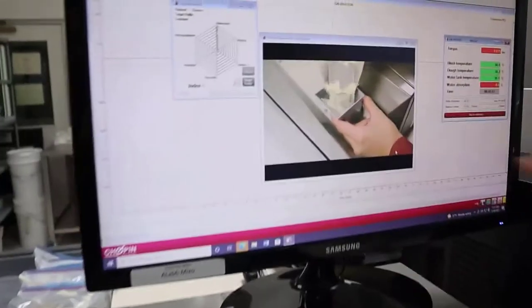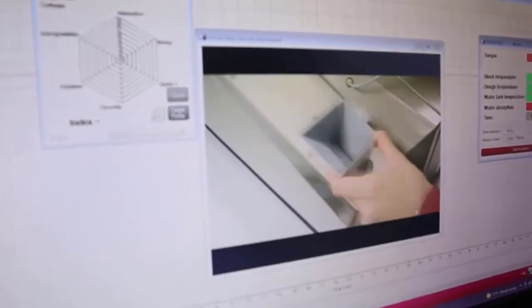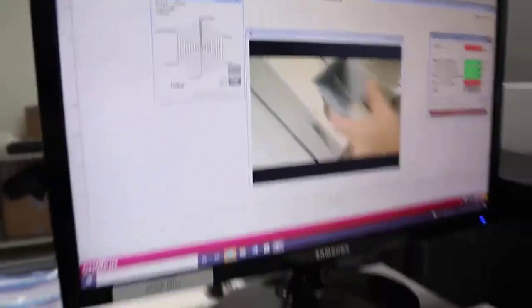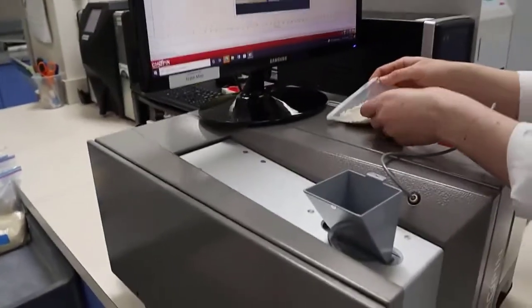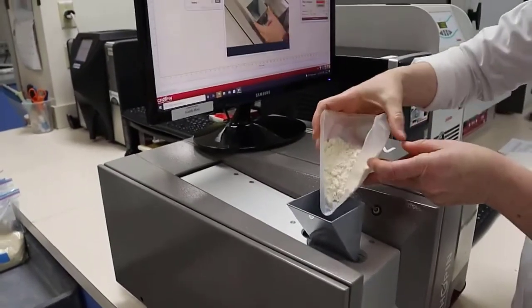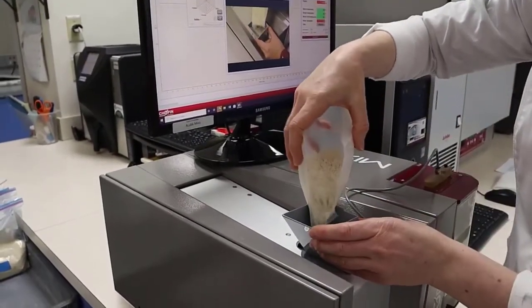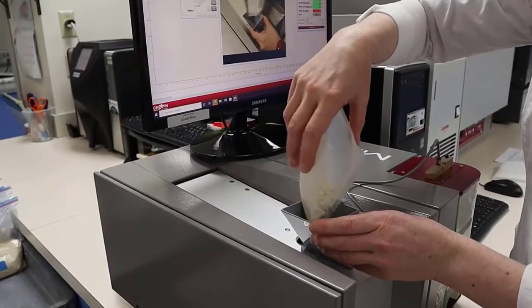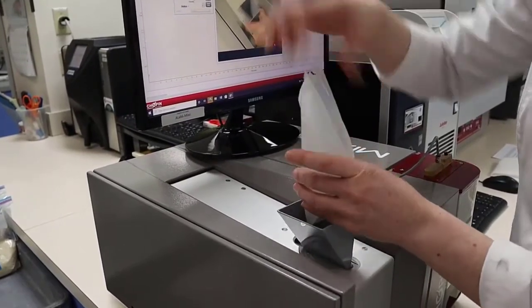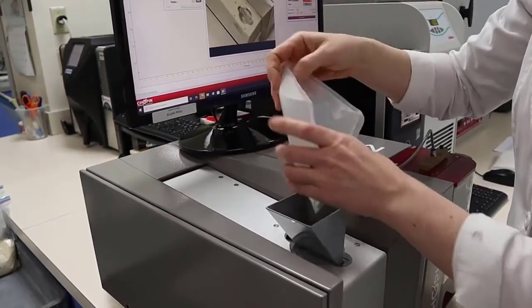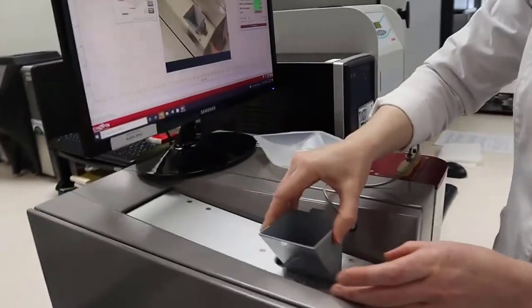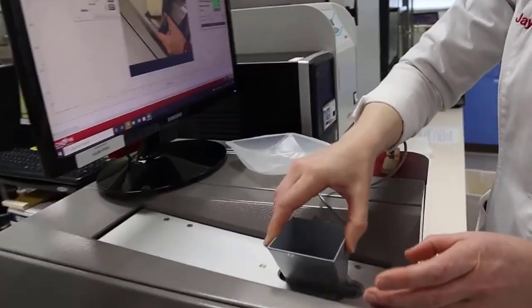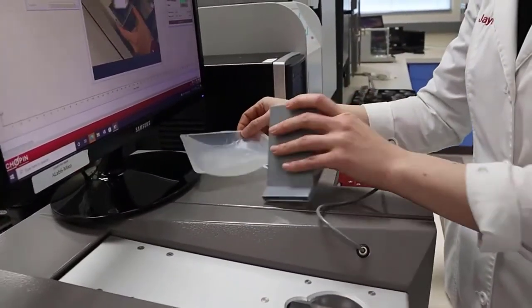So the software automatically pulls up videos showing what you need to be doing at any particular point in the test. So at this point I need to be adding the flour. So using the funnel that comes with the instrument, make sure I get all the flour in.